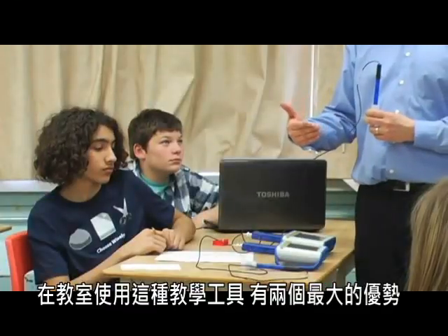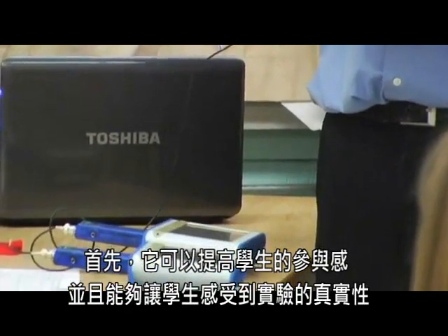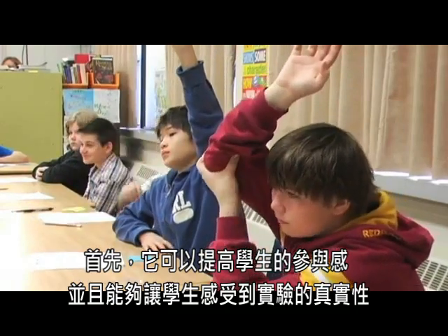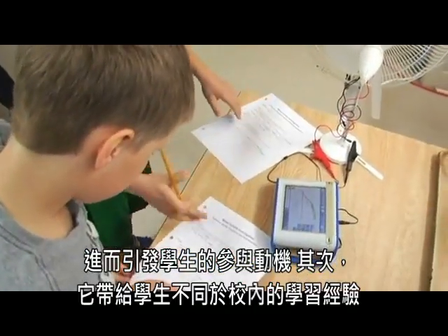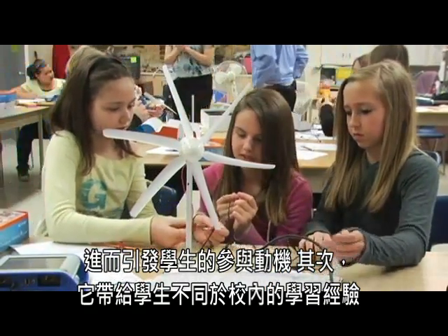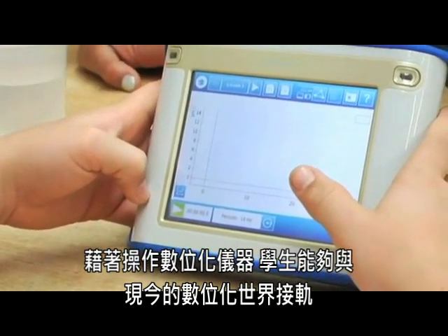There's really two huge advantages of using this kind of learning tool in the classroom. First, it improves student engagement because they're motivated to do something that seems really authentic. And second, it prepares them for the world outside of school, because that's where the world is now, in digital data analysis and collection.